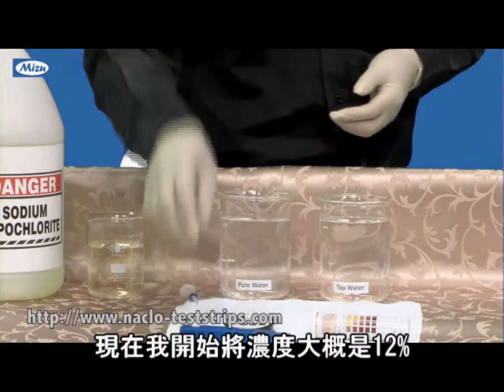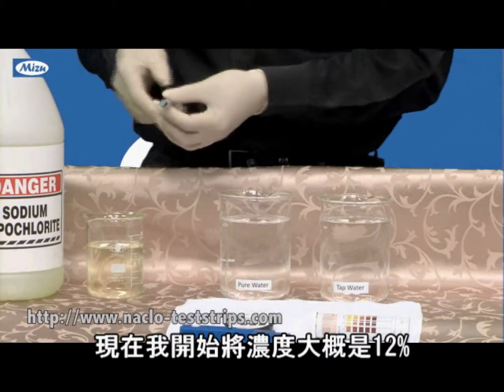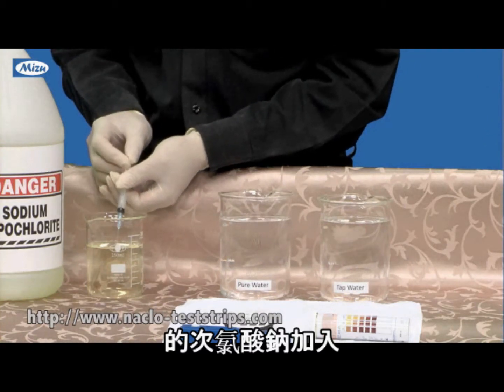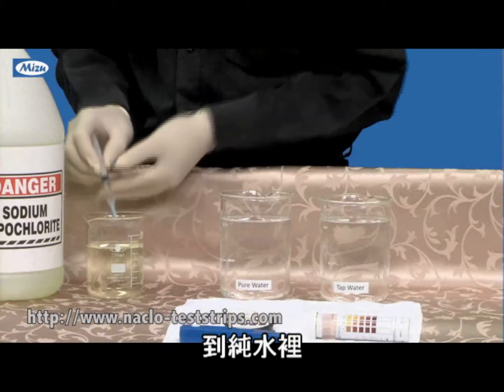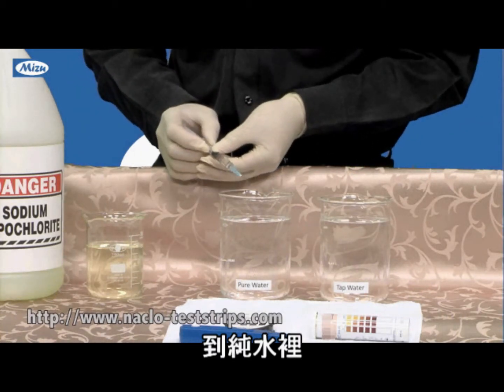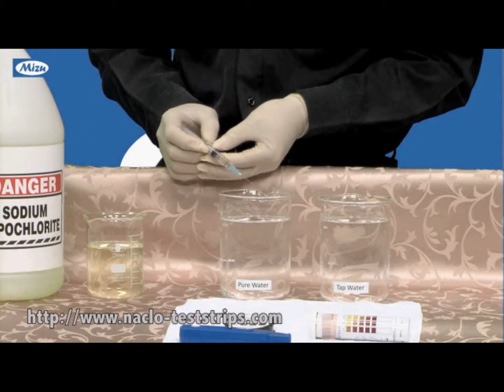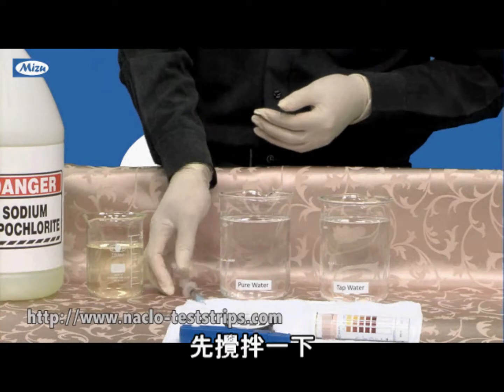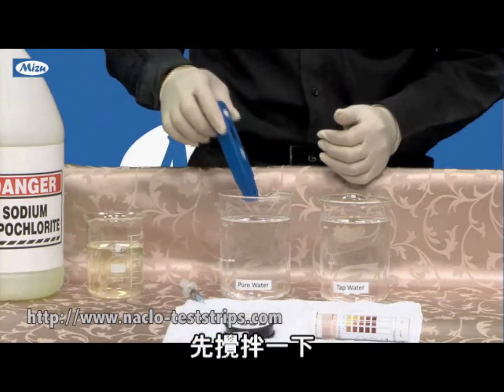So I started to add the sodium hypochlorite — this is about 12% concentration — into this pure water, and I agitate it a little bit.